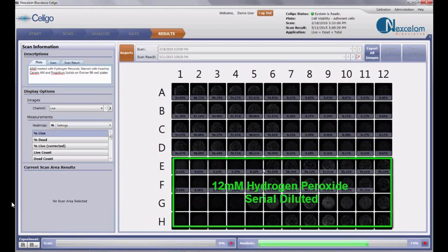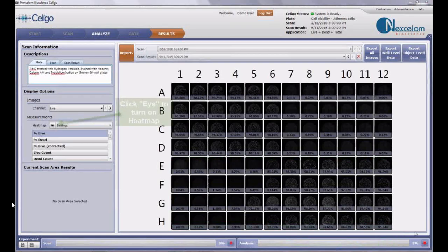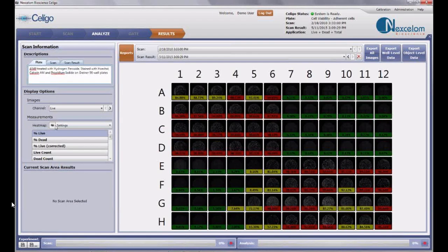And then you can just see the thumbnails are populating with the data on top of them. And the numbers look pretty consistent with the treatment as expected. But for easier viewing, let's turn on the heat map because that's a little bit easier. It'll color code to the values. So currently we can adjust the maximum to maybe 80.